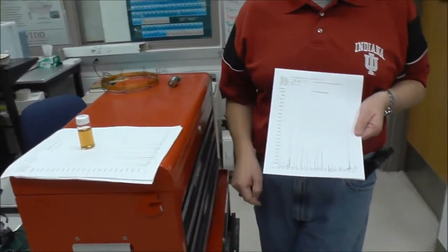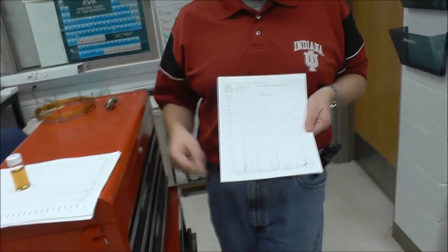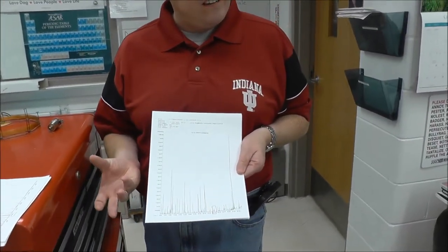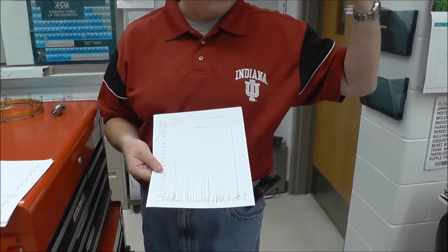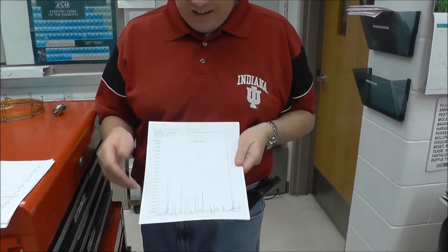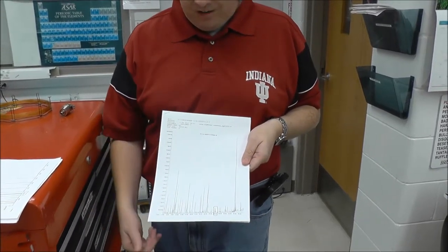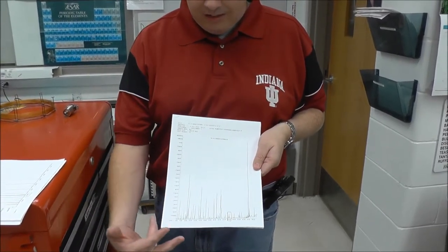So literally you take 25 fruit flies, you hit frappe, you spin out all the hard chitin, you extract out all the small organics, the sugars, the proteins, the lipids, all that good stuff. We make them volatile by putting methyl groups on them, and then we separate them out.